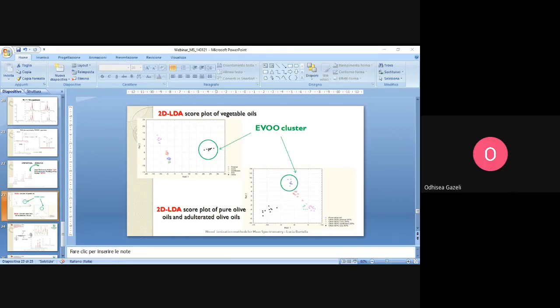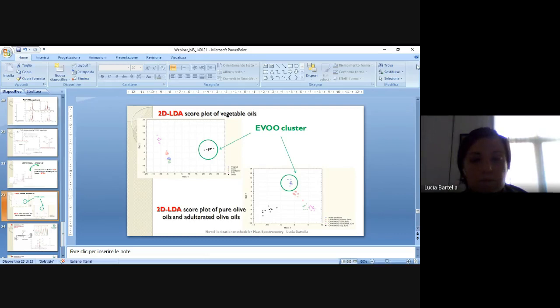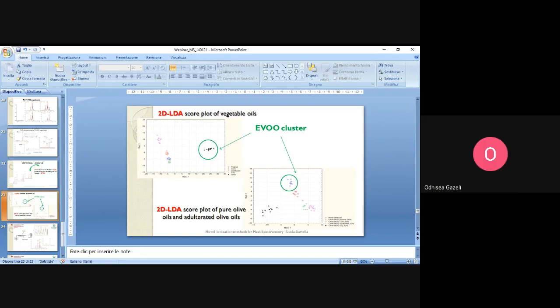But I can't understand why you have such diversity in the black points. I can see the olive oil 80%. Does this diversity of the points have to do with characteristics of the olive oil, or is it something like error from the data?